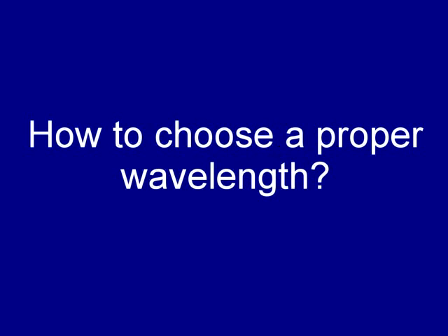Now that you know how to obtain data from your colorimeter, let's take a look at some aspects you can explore during the present set of experiments.